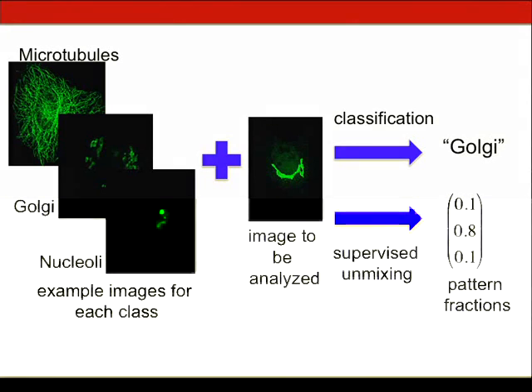And if we look at, for example, in UniProt or any of the other protein databases, we may see GO terms that say a particular protein is present in Golgi, or maybe it's in Golgi and ER, but you won't find any kind of estimates of how much of the protein is in those various compartments. And this gives us, for the first time, a way of representing that.